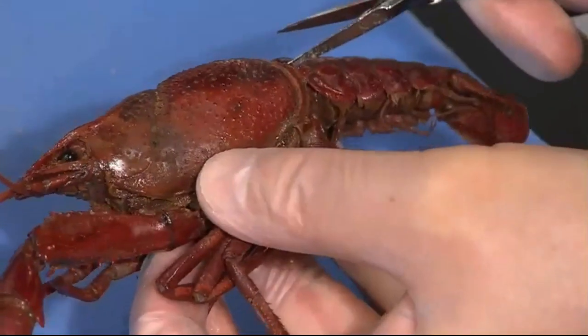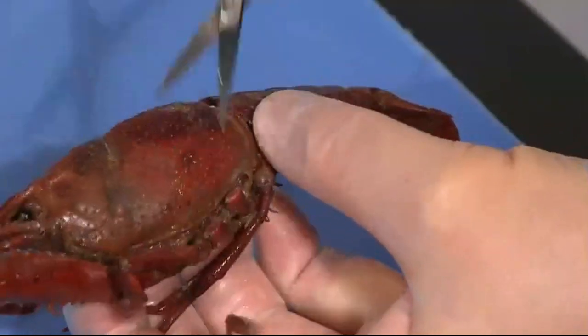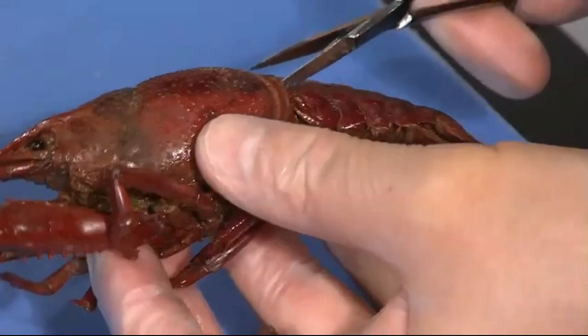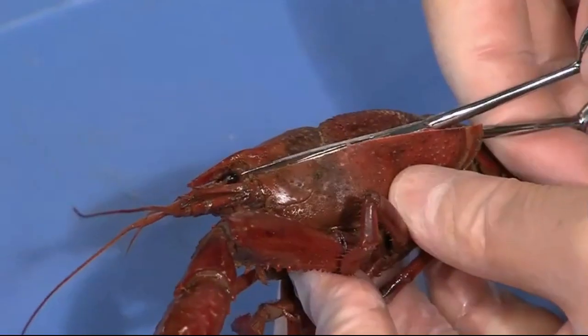You can even remove appendages if you want to, if they're getting in your way. We're kind of done with those now. So you just cut up again toward the eye.